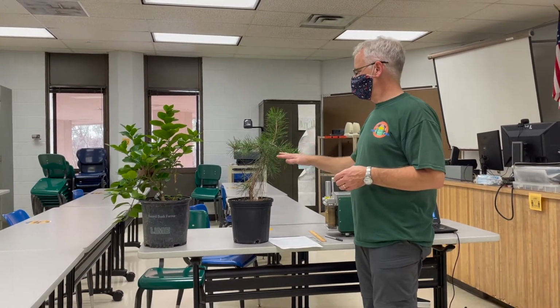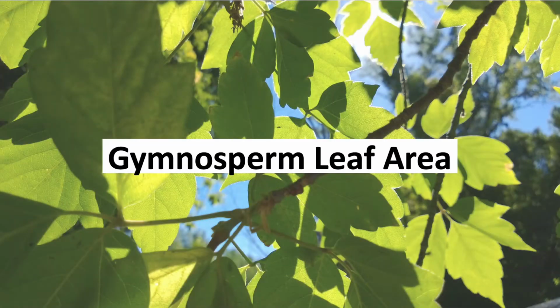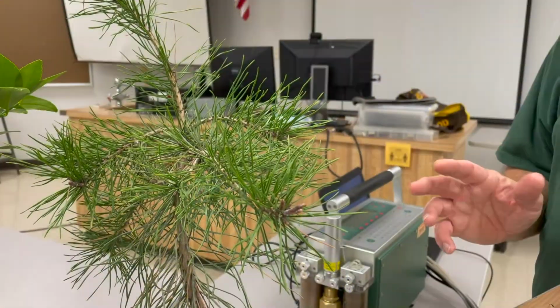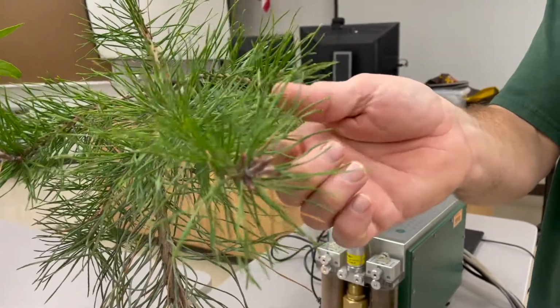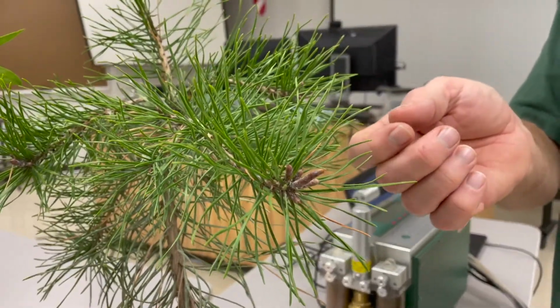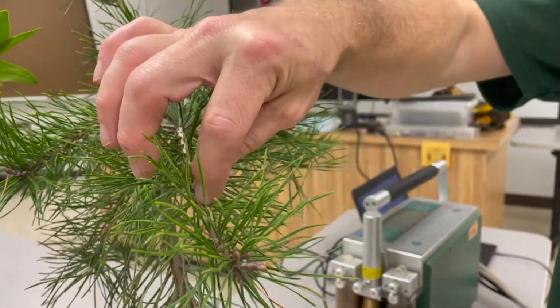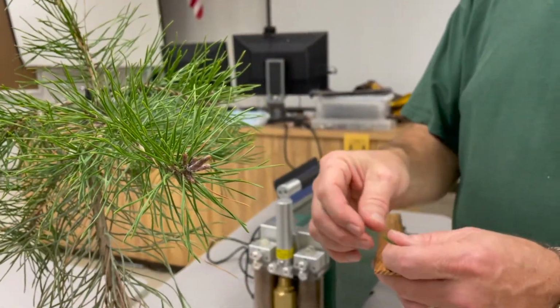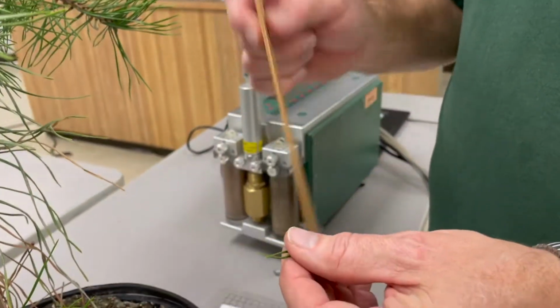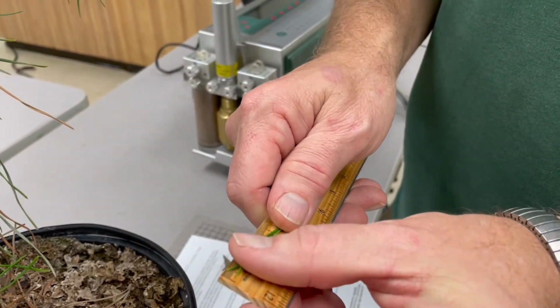Okay, for the second part of the lab, we're going to measure the total amount of leaf area on the pine and on the angiosperm. So for the pine, as you can imagine, it's difficult to calculate the leaf area of a pine needle. It's three-dimensional, it has a strange shape, so we're going to use a formula that relates the length of a fascicle of a pine to the area of the needles in that fascicle. So what we're going to do is measure the length of a fascicle in millimeters.